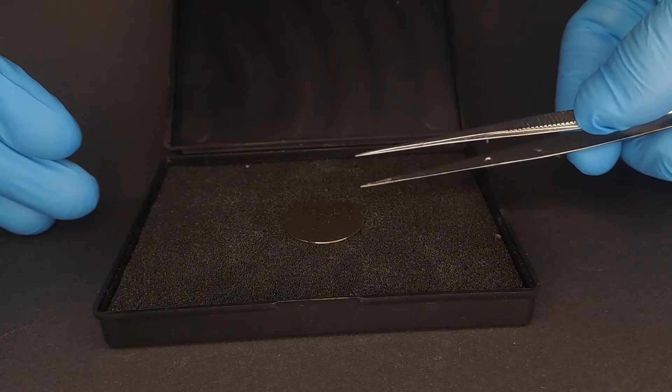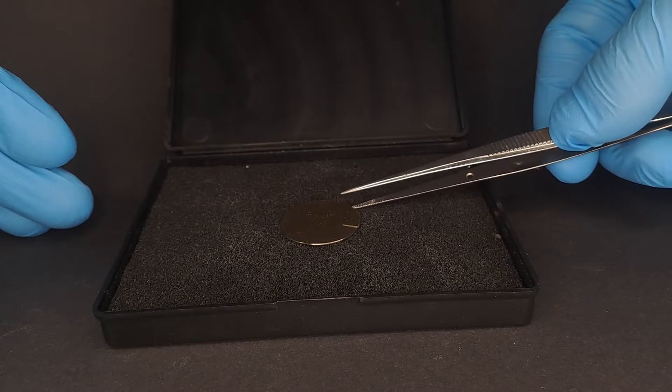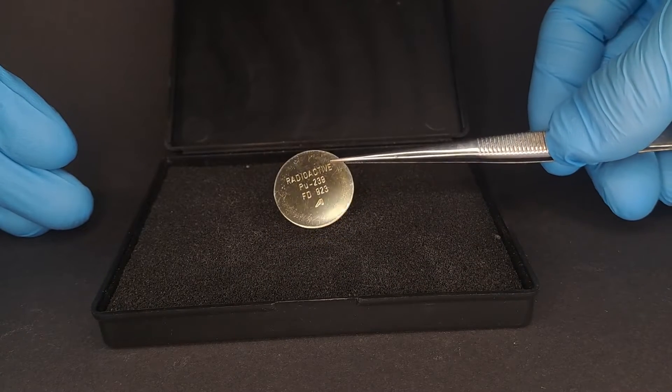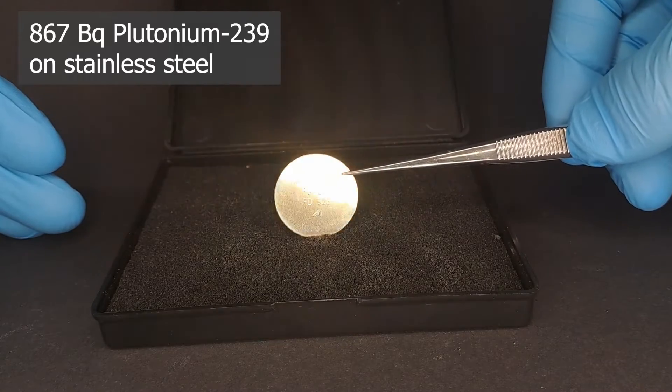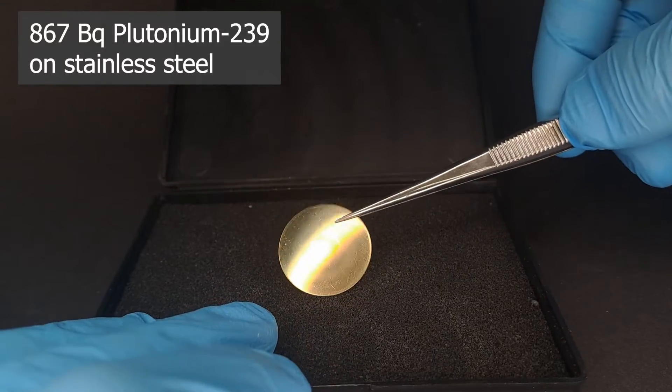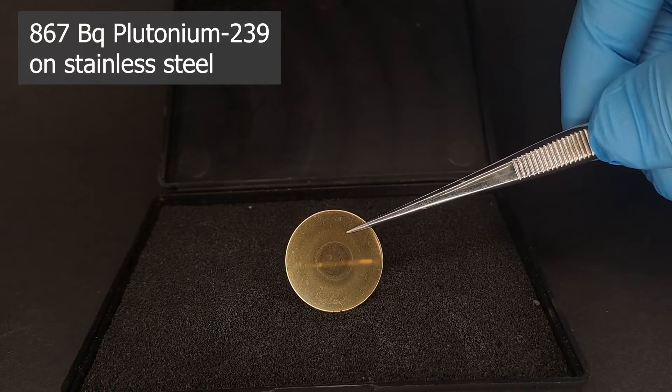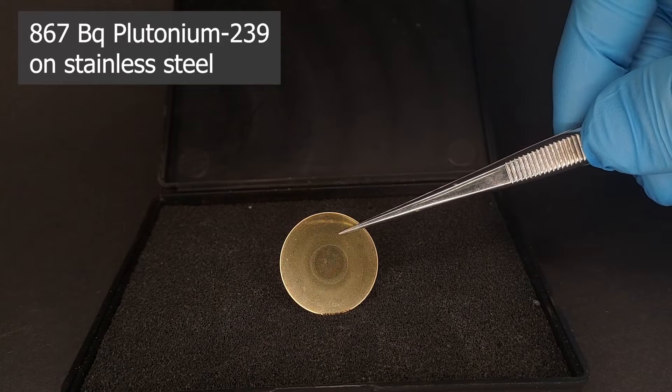What we have here is an alpha calibration sample and that is exactly what it's used for in our lab. The plutonium was electrochemically deposited on a stainless steel coin. There are precisely 867 becquerel of plutonium on it.